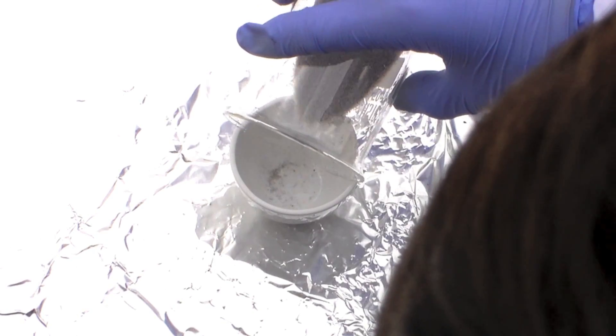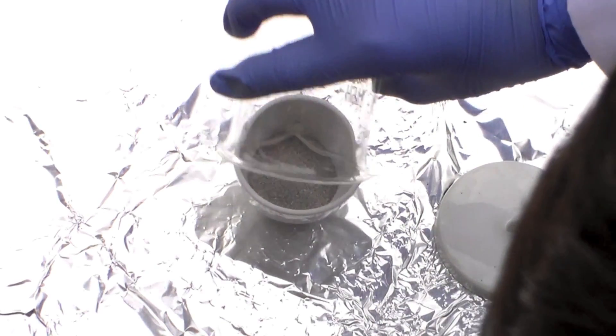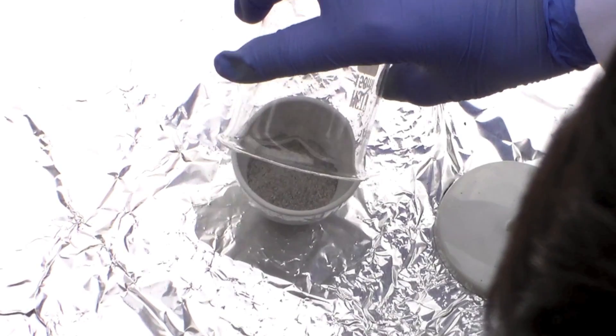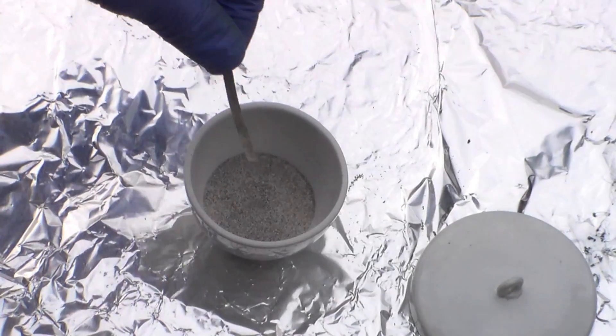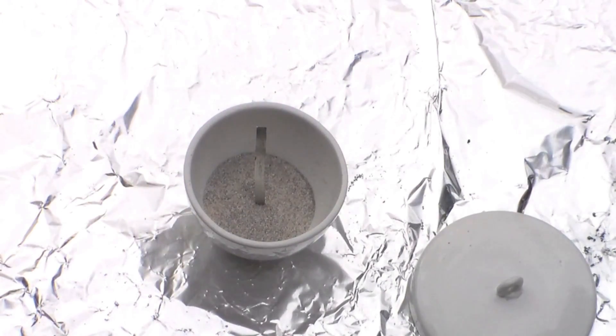I didn't want to use a test tube because I can't afford to break one, but this crucible will easily be able to withstand the heat produced in the reaction. Alright, so I'm going to stick a magnesium ribbon in this thing and see if it ignites.